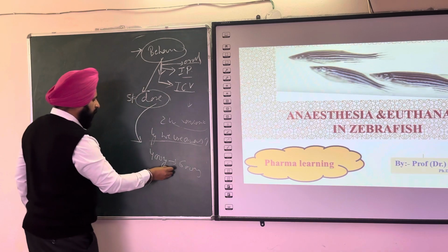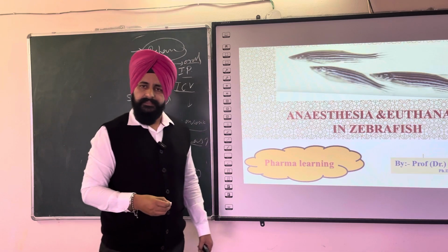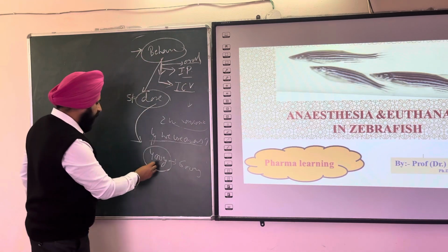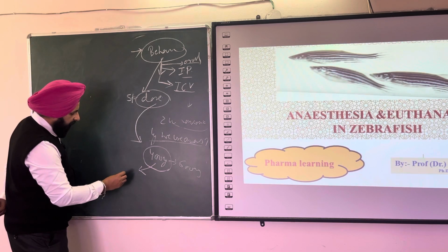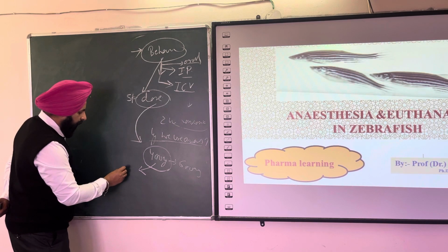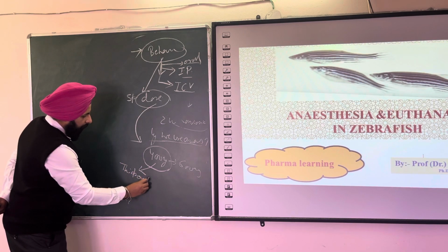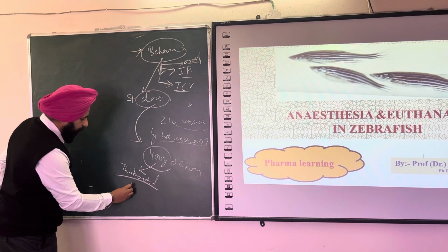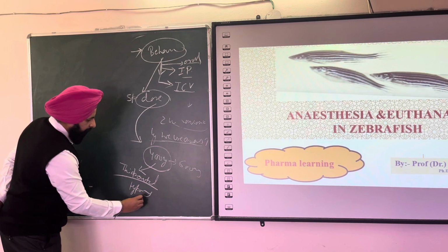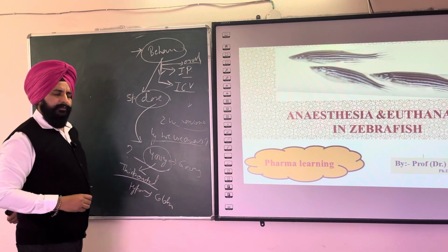Suppose you select a zebrafish weight of 400 mg and you are thinking to give it an anesthetic, like thiopental sodium, or hypothermia by coldness, or any other drug.